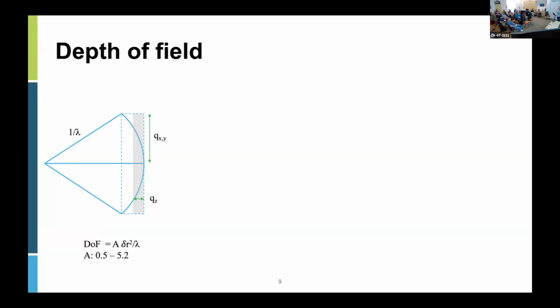An intuitive way to understand this effect is that the scattering signal expands over an Ewald sphere surface. But usually, we perform the measurement with a flat detector. So when we are collecting high Q signal to achieve higher resolution, the flat detector deviates from the Ewald sphere further away, and that blurs the features outside the depth of field range.